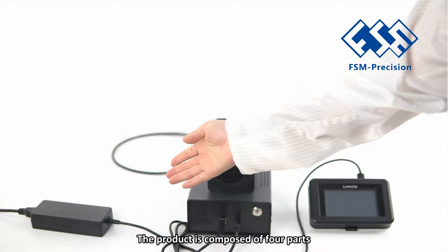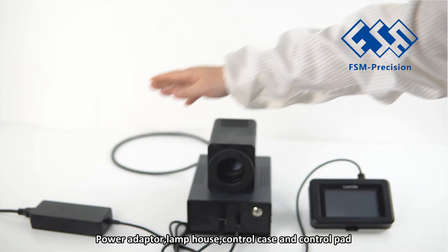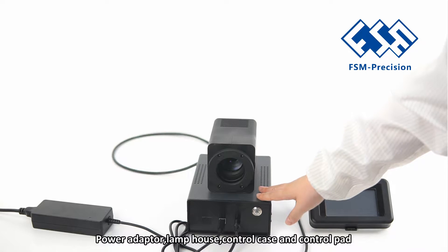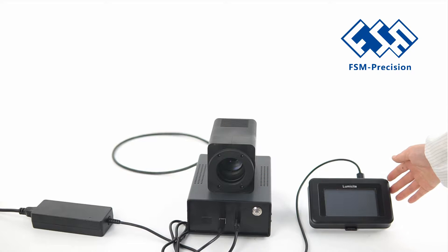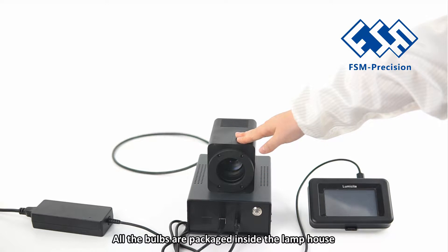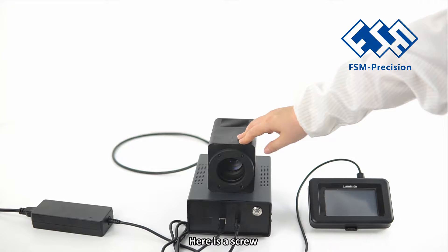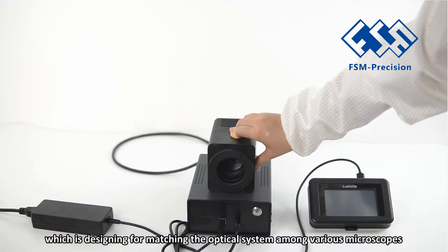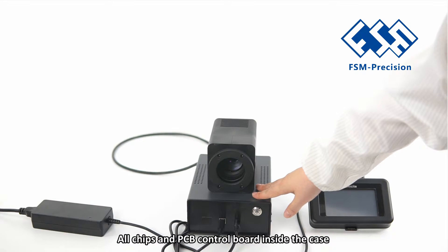Now let's have a look. The product is composed of 4 parts: power adapter, lamp house, control case, and control pad. All the bulbs are packaged inside the lamp house. The main LED suppliers are CREE, LG, and CLE. There is a screw designed for matching the optical system among various microscopes. All chips and PCB control board are inside the case.